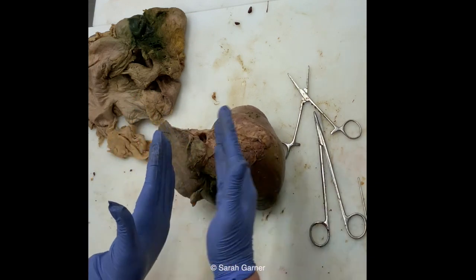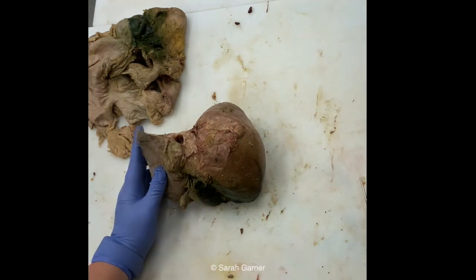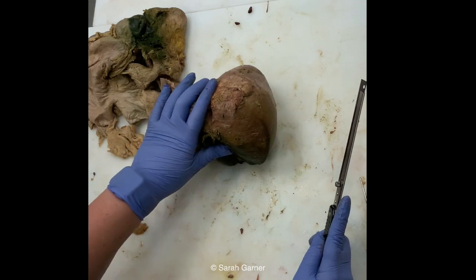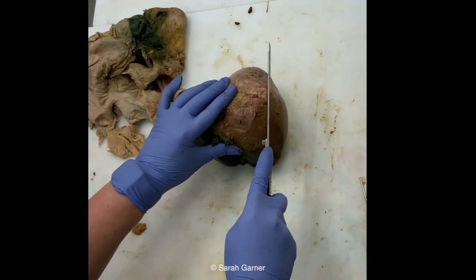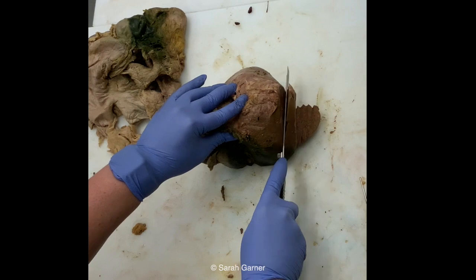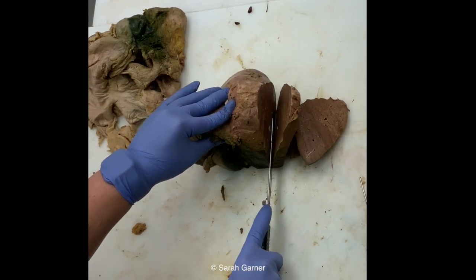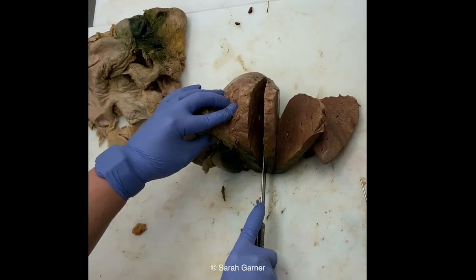And then basically you'll just serially section, or bread loaf this. With this, again, especially in a fresh body, this is going to be very slippery. So if you need to put a towel down or hold it down with a towel, then do so. But essentially, you're just going to be cutting it. This is cutting really poorly because it's so fixed, but you're essentially just going to be cutting and examining the cut surface, just like we did with the kidneys.